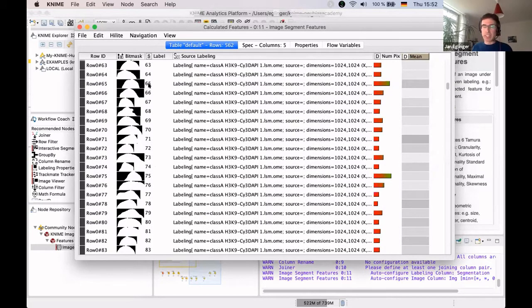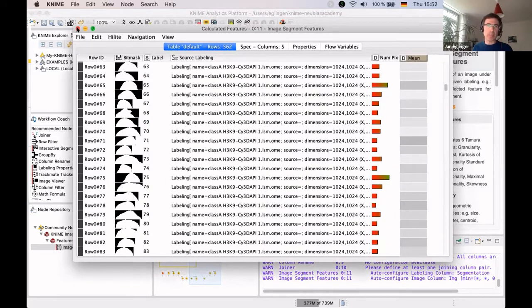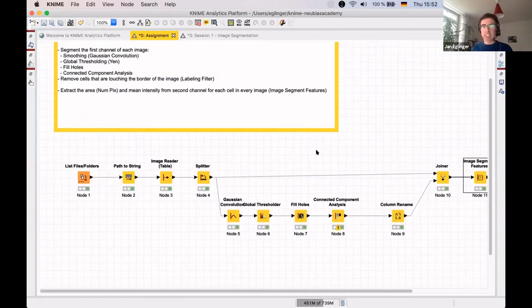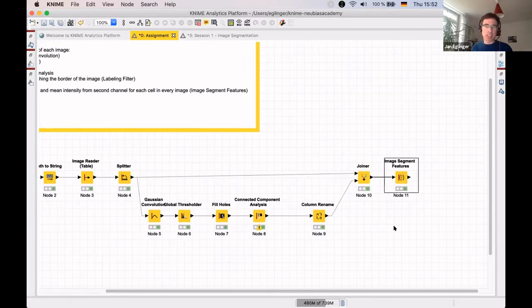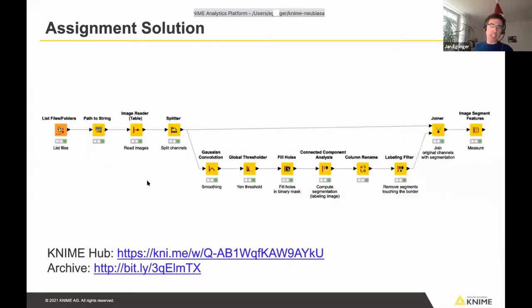That covers the actual assignment — we extracted the area and measured the intensities using segmentation from the first channel and measurements on the second channel. We've also put the solution on the KNIME Hub, downloadable as a KNIME archive file, so feel free to download it anytime. As a follow-up, I'll now quickly highlight some alternative segmentation methods.